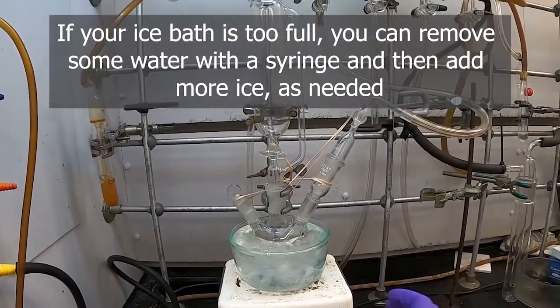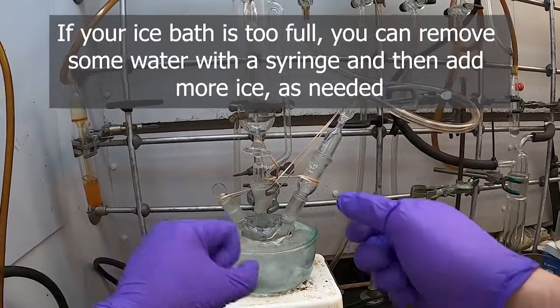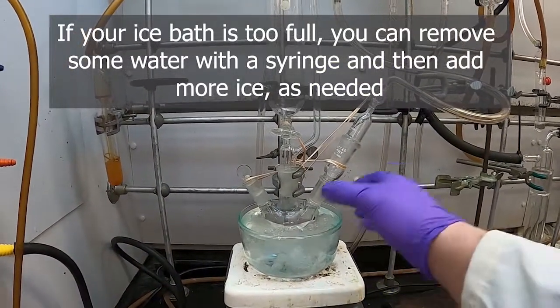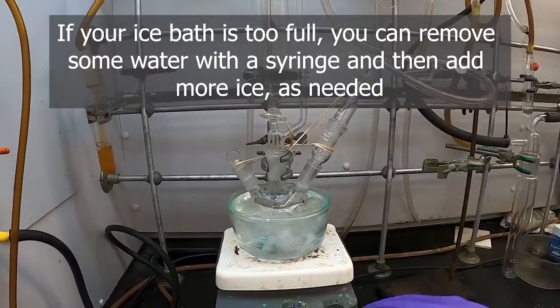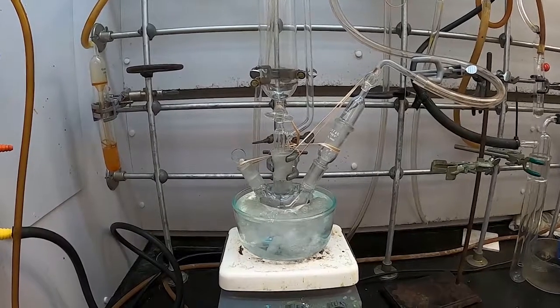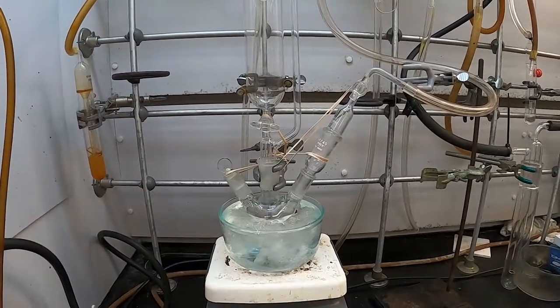One thing you'll want to have nearby is a beaker, or sometimes a syringe with a little short piece of tubing on the end. I don't have one at hand. It's a great way to remove a little bit of extra water and then be able to add more ice as it melts. Then we can get a thermometer, and look at how cold this bath will get in a few minutes.